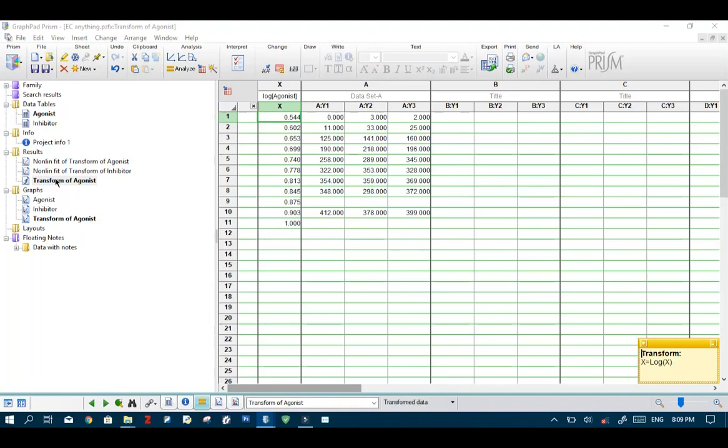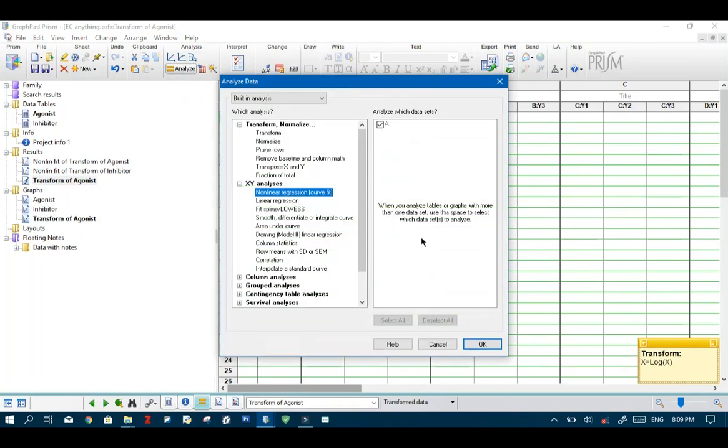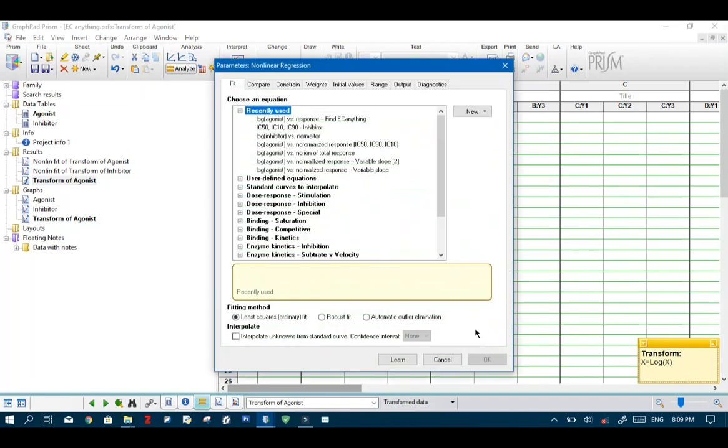Now next make sure that this same data sheet is selected and hit analyze.